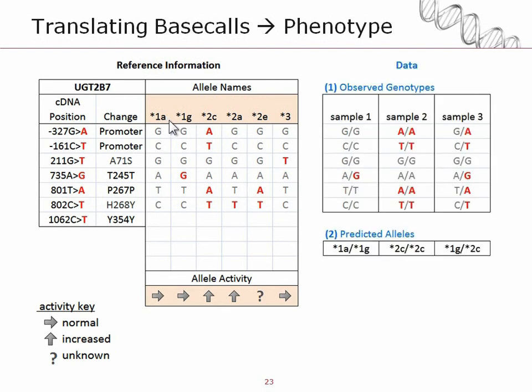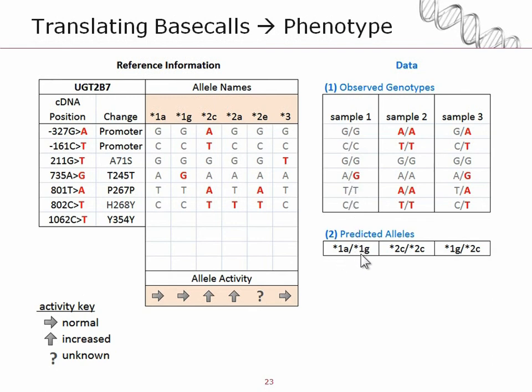Let's match this information to some data that we have for three samples. For this gene, sample one has a pair of genotypes — one from each parent. We are reference homozygous for five of the six markers and heterozygous variant for the fourth marker. The first part of haplotyping is to determine what pair of star allele names is consistent with these observed genotypes. For sample one it's fairly obvious that the only combination consistent with the observed genotypes is star 1a and star 1g — one from one parent and one from the other. The predicted star alleles for that sample are therefore star 1a and star 1g.